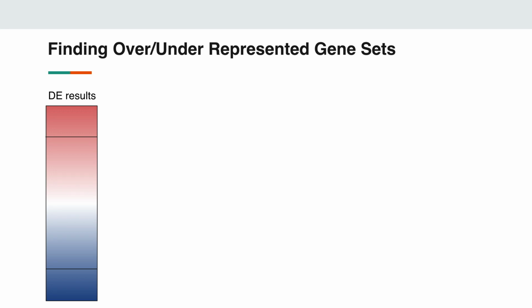And in this case, we'll go back to that example where you guys just computed the differential expression and you have your results for all of those genes, and you established a cutoff where you decided that genes that meet that threshold were either upregulated or downregulated in your samples of interest. So after establishing such a cutoff, we were left with 435 genes which we considered induced in your experiment compared to the control.